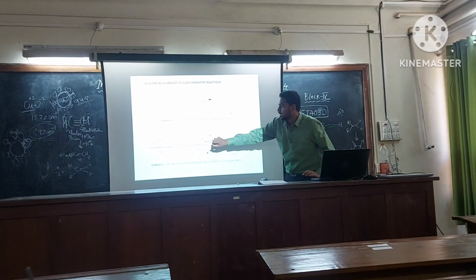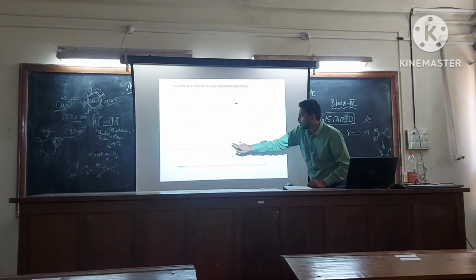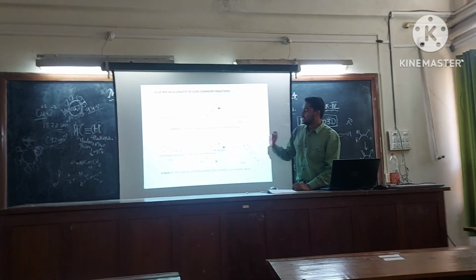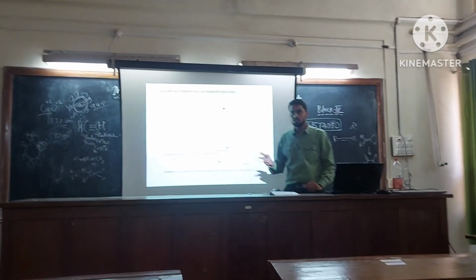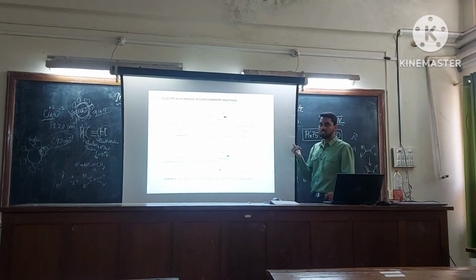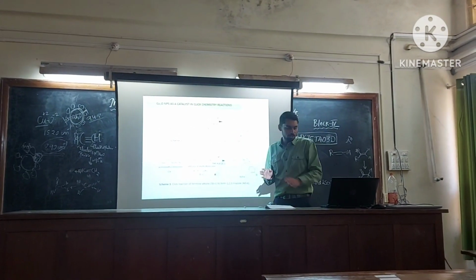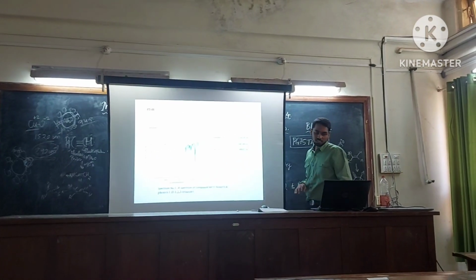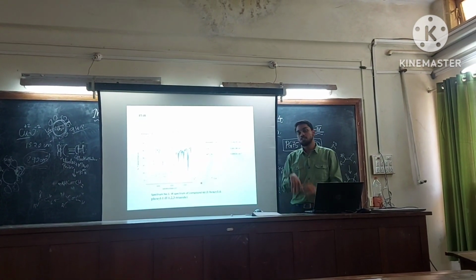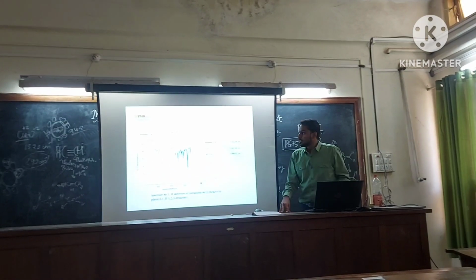While doing these reactions in our project, we took two compounds. We replaced R initially by H, and in another compound we replaced R by CH3. We obtained two products and named them 4D and 4E. So let us come to the FTIR of 4D. Now we are going deep into the characterization of the triazoles that we obtained. This is the first one, 4D.